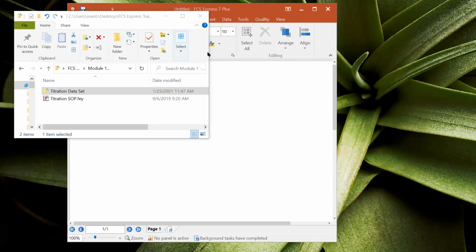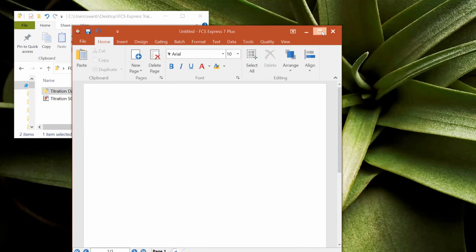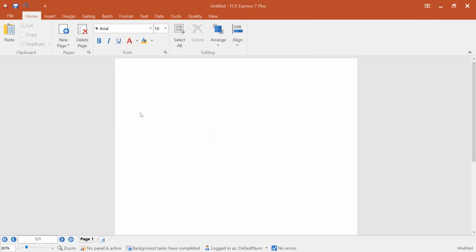And we're going to give you, again, working with the first kind of workflow of an antibody titration, a little bit of an overview of how the software will actually get utilized. You can see here, I have FCS Express open, right? And you're probably saying to yourself, well, this looks exactly like Microsoft Office. It looks like PowerPoint. It looks like Word. It can even look like Excel in some cases. And that is shamelessly by design, right?